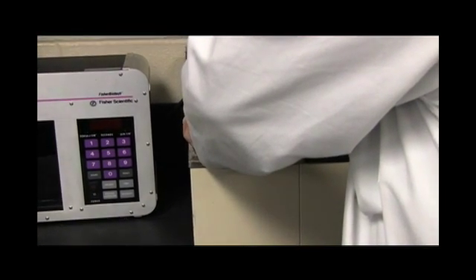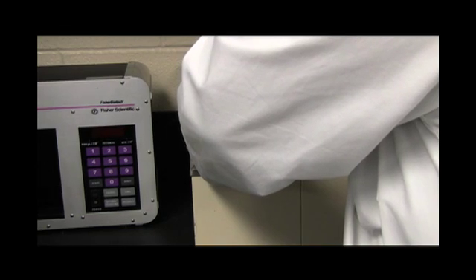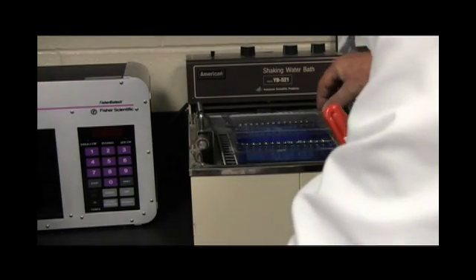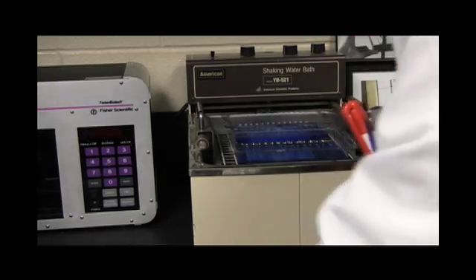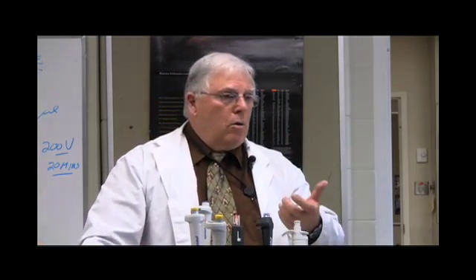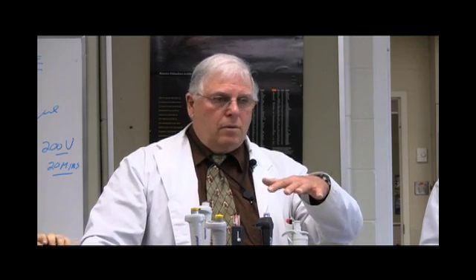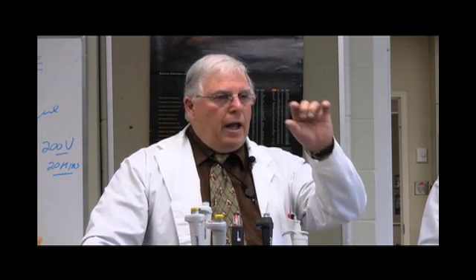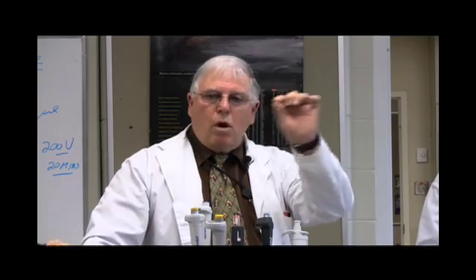The more the dye liquid moves over the agarose, it will eventually attach to your RFLPs—your little DNA pieces. Tomorrow we can pour off the excess dye and your agarose RFLPs will all be stained.